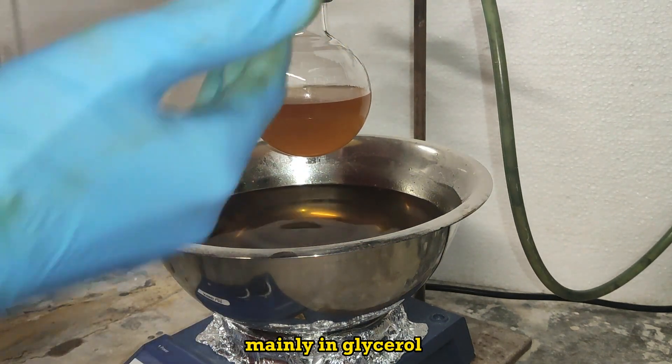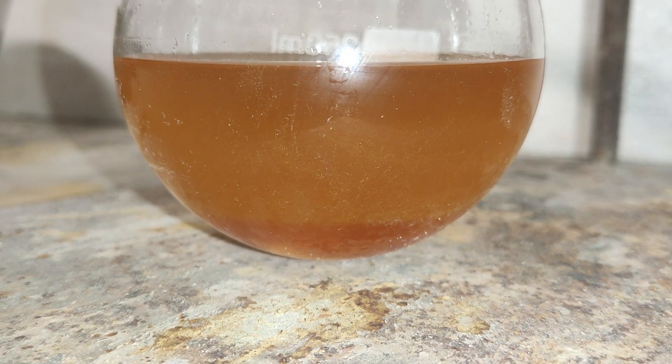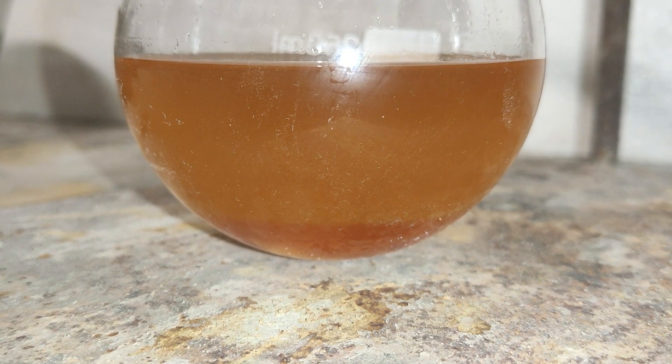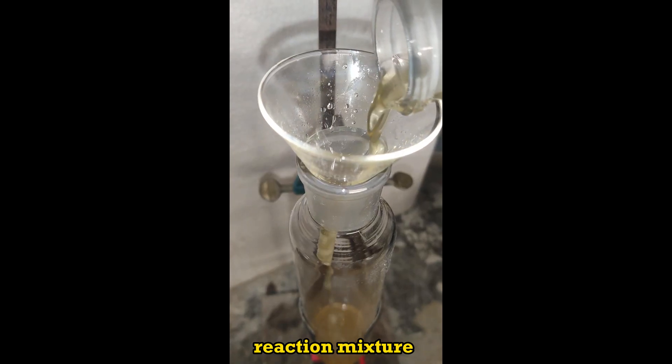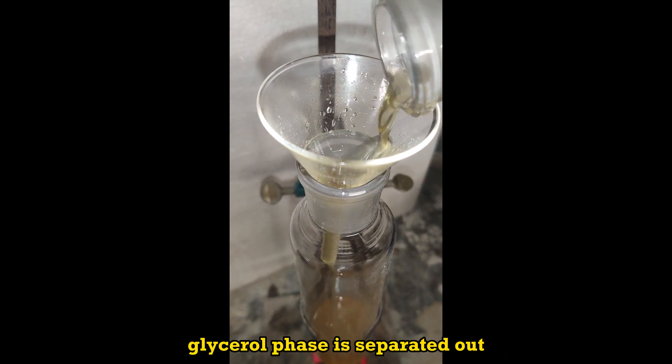The bottom phase consists mainly of glycerol. The reaction mixture is introduced in a separatory funnel and the glycerol phase is separated out.